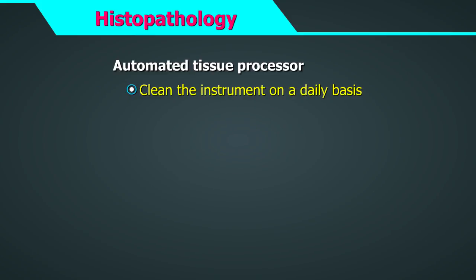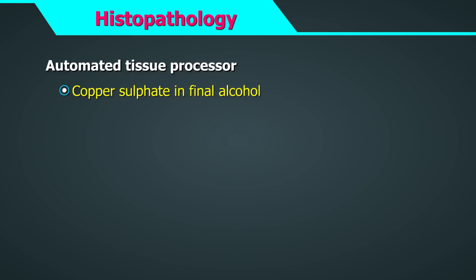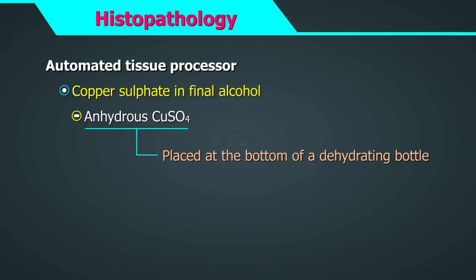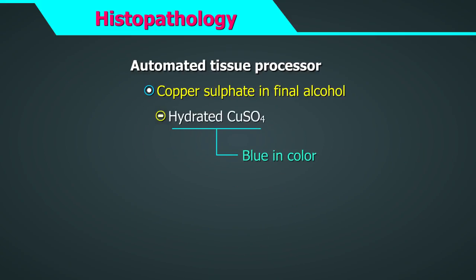Clean the instrument on a daily basis and mop any reagent spill immediately. Once a month, lift the carousel cover to its upper end position, clean the carousel axle with a cleaning cloth, and apply a thin coat of equipment oil. Preventive maintenance should be done once a year by an authorized service manager. A layer of anhydrous copper sulphate is placed at the bottom of a dehydrating bottle and covered with filter papers. Anhydrous copper sulphate removes water from alcohol — it is white in colour while the hydrated form is blue, so it acts as an indicator for the presence of water.